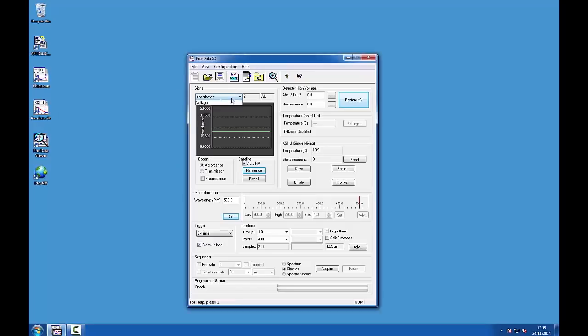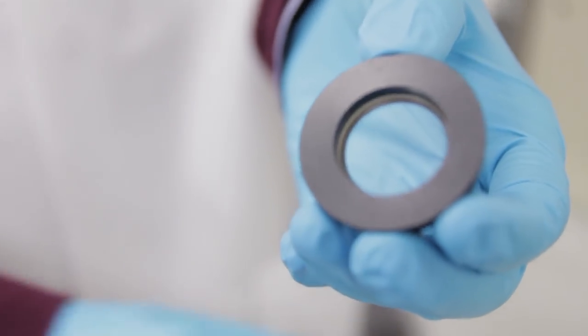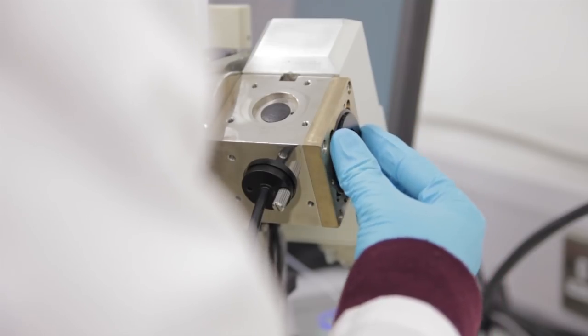Next we shall focus on running a fluorescence experiment in which we are measuring light emitted perpendicular to the light from the monochromator. Emitted fluorescent light is of higher wavelength than the excitation source. We usually therefore place a long-pass optical filter in front of the detector to block out scattered excitation light.